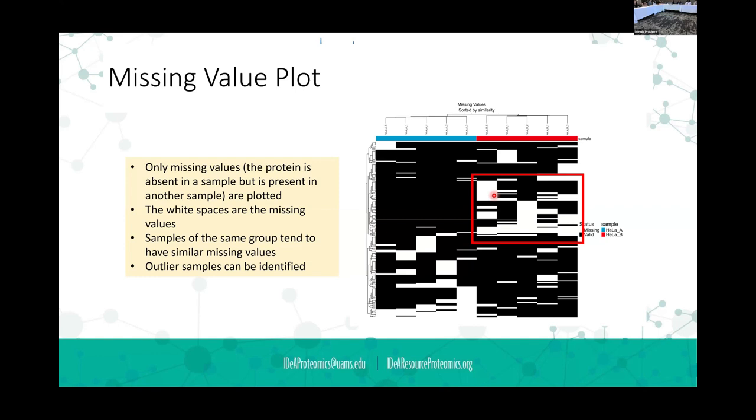Well, number one is it could be because it's low level. So the changes between whatever treatment we've got going on here, between the blue and the red, has caused that protein, the peptide, the protein concentration to now be lower. Therefore, there are fewer peptides, therefore there's less signal. And so the mass spectrometer is picking up on those, and it's now down in the noise, and it doesn't pick up on those things.